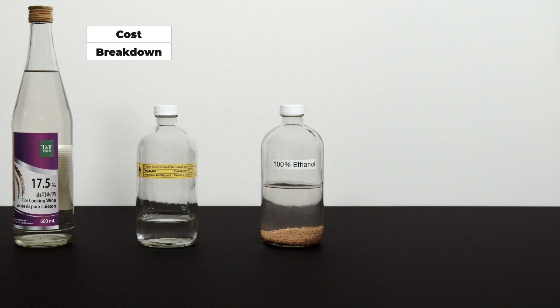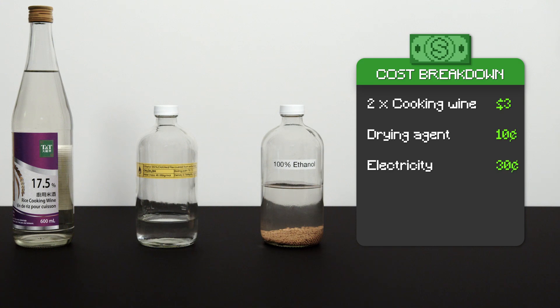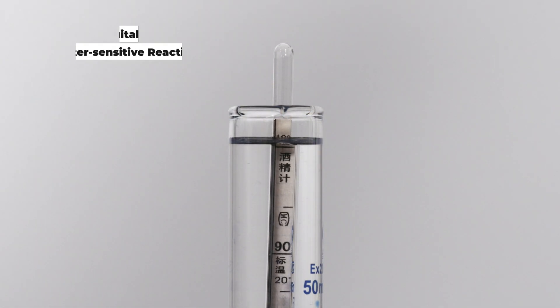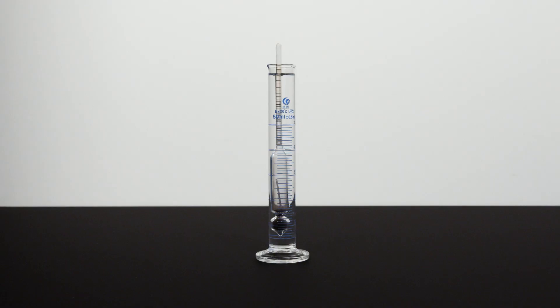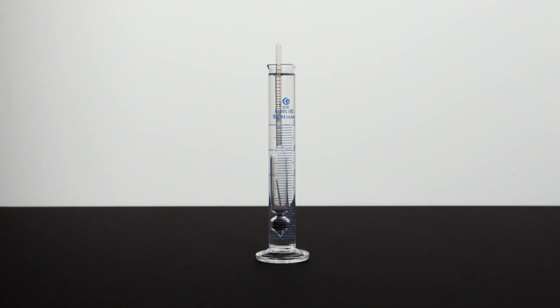Now for the big question: is this method of getting 100% ethanol cheaper than just buying it? Two bottles of 600ml cooking wine cost about $3, drying agents 10 cents, electricity 30 cents — total cost is $3.30 per 118ml, which translates to $28 per liter. Considering the cost and difficulty of getting anhydrous ethanol, this method is a win. One extra thing to mention: although the hydrometer shows 100% ethanol, there is still a tiny bit of water — it can be used in most reactions requiring an anhydrous solvent, except water-sensitive reactions like Grignard reactions, which require in-situ chemical drying.